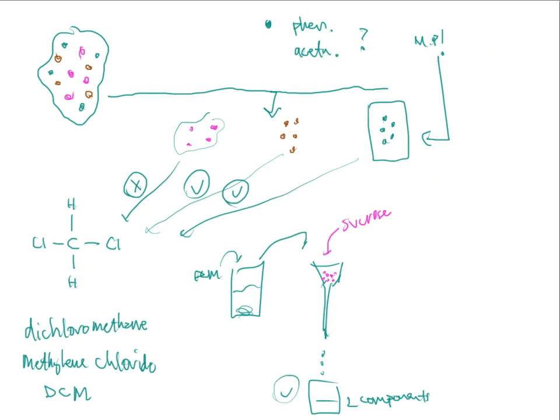All right? So when I separate those two components, I've got these two down here in the beaker. Now I need to separate those two from each other. So what I do is add the hydroxide or the bicarbonate, whichever one the lab book tells me to do. And when I do that, I'm going to see some solid that begins to fall out at the very bottom of the beaker solution. And this solid, I'm then going to pour through a filter yet again.